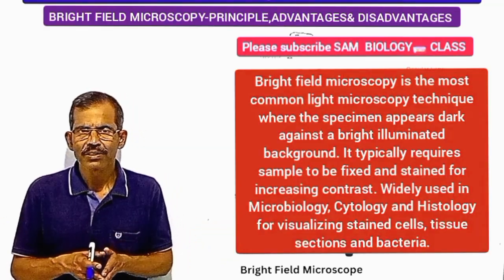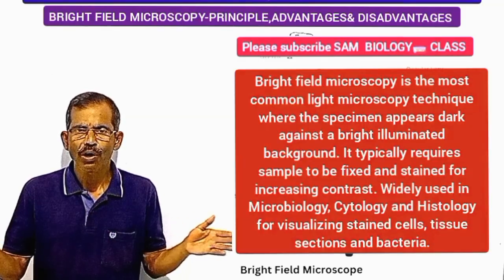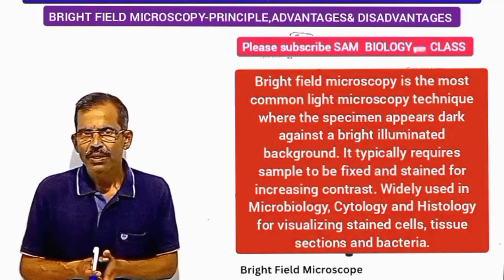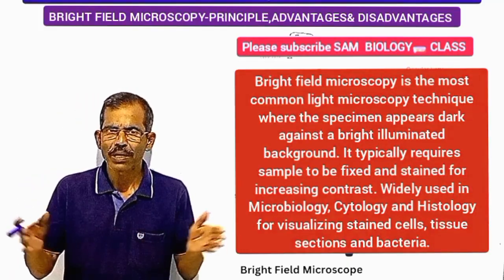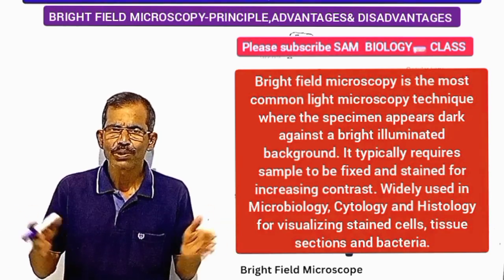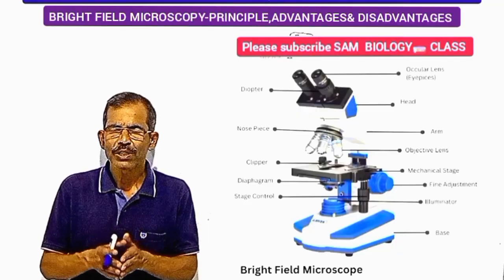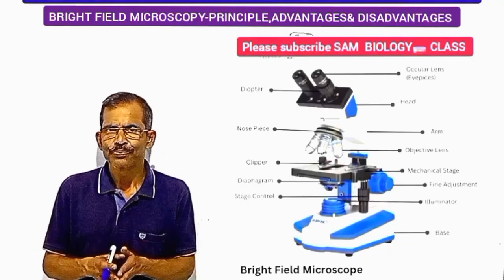As a result, the specimen appears nearly invisible or has extremely low contrast. Because of this, the sample blends into the background. As a result, it becomes difficult to visualize structural details and the specimen appears white or transparent.